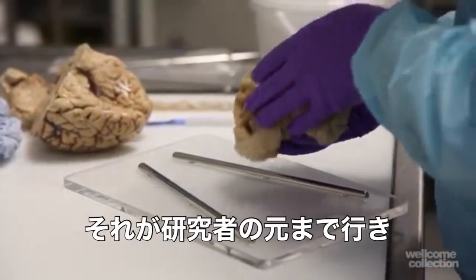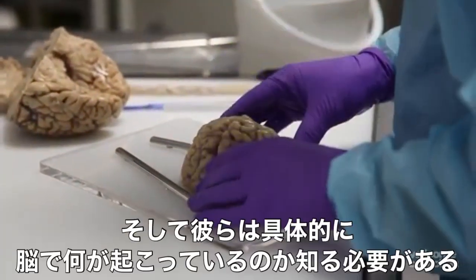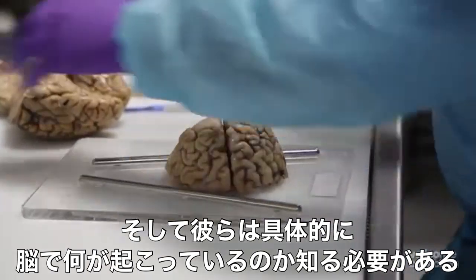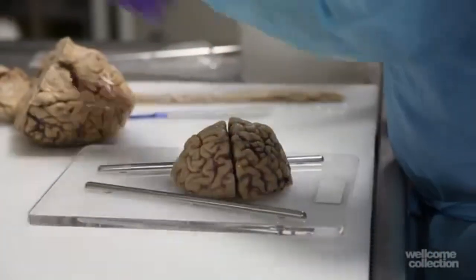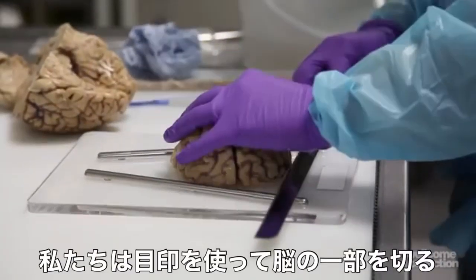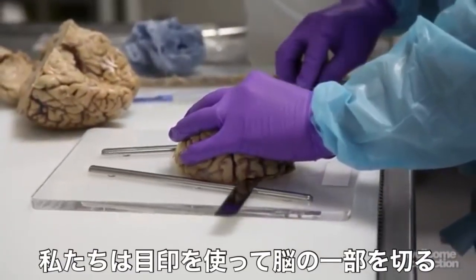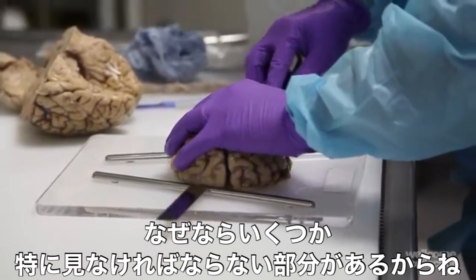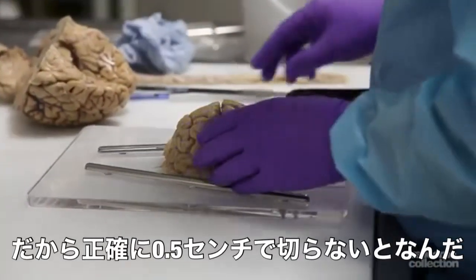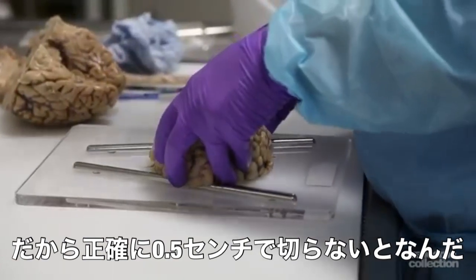In this way we can build up a diagnostic report of what the problem was with that particular patient. This is very important because the tissue then goes out to researchers and they need to know exactly what was going on. We cut the sections using a guide because there are some parts of the brain that we need to look at which are quite small, so we have to accurately make a half centimetre slice.